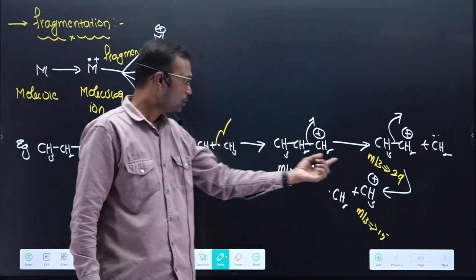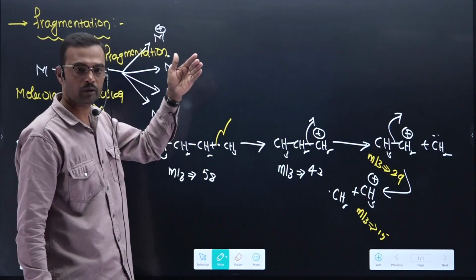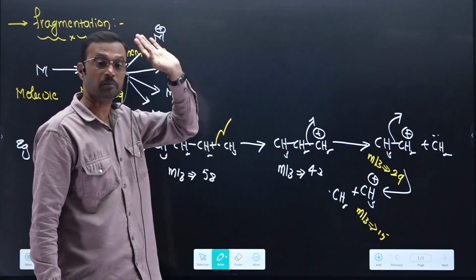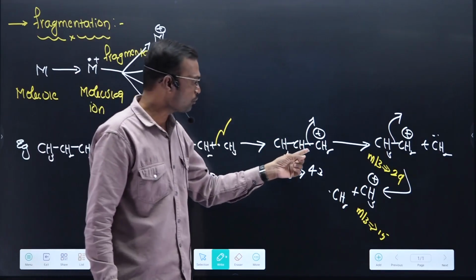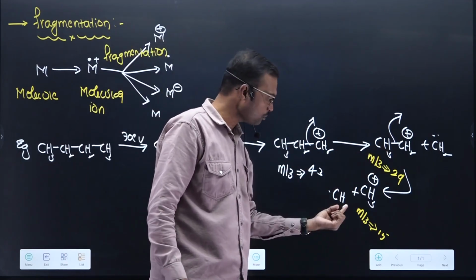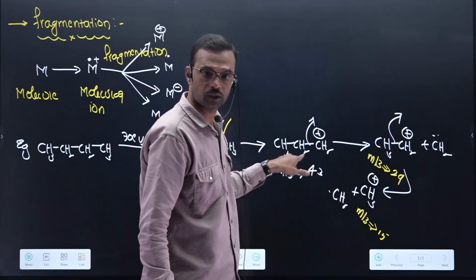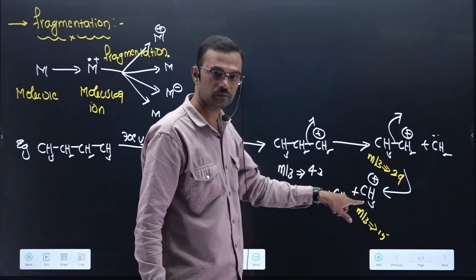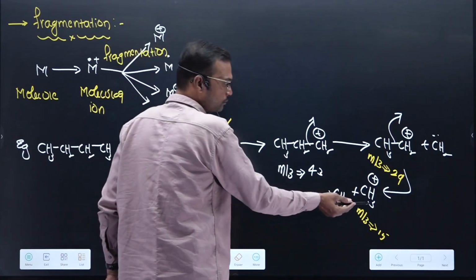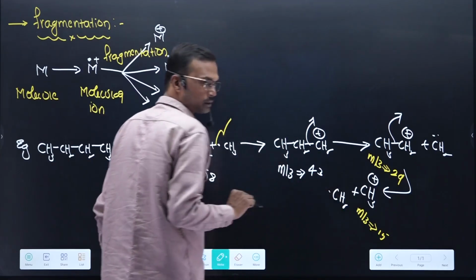Okay. So the formation of all these ions is only from one molecule. That is called a unimolecular process. And one more, it is a continuous successive step by step process. Step by step means this will form from this. This will form from this. And this will form from this only. This cation is never given by this one. Without this formation, it is impossible to get. Right or not? See, this cation never gives this one. Suppose you are getting a peak at 15, it is coming from which one? 29 only. That is called step by step process.